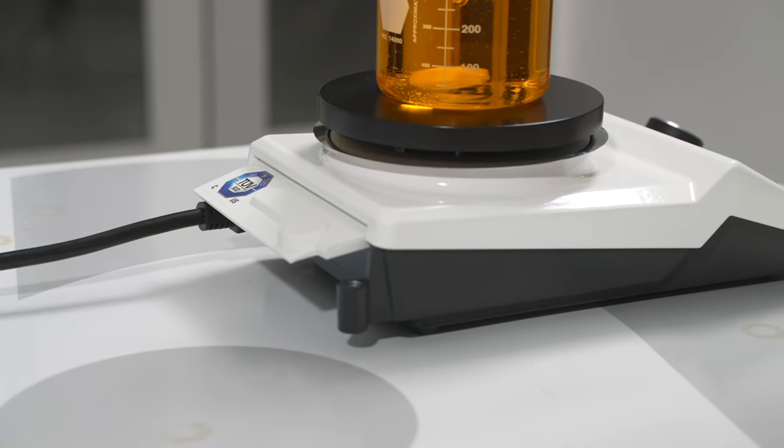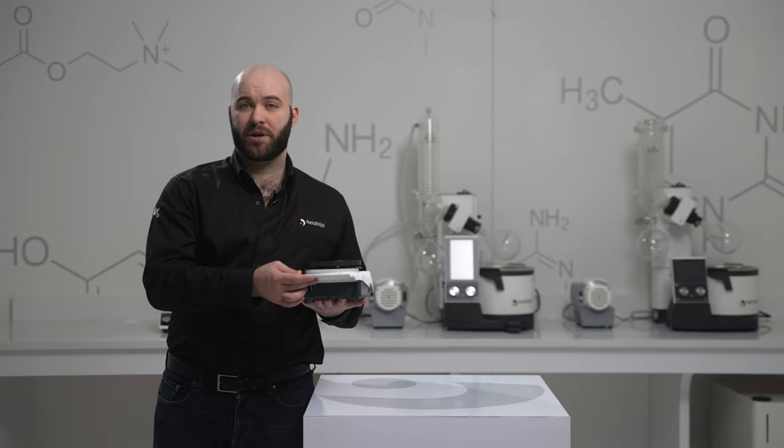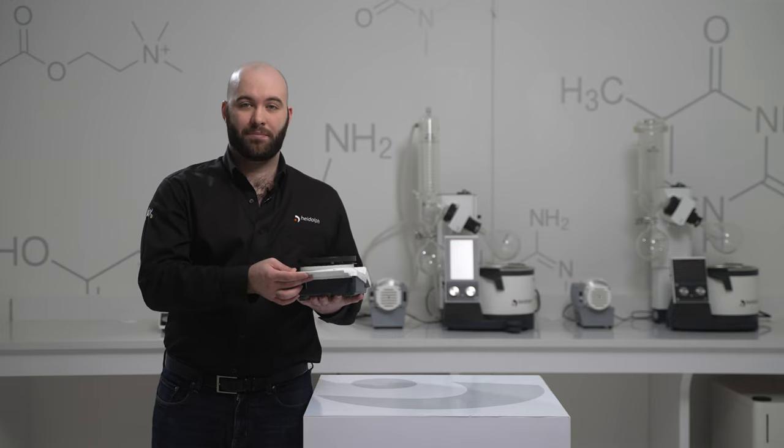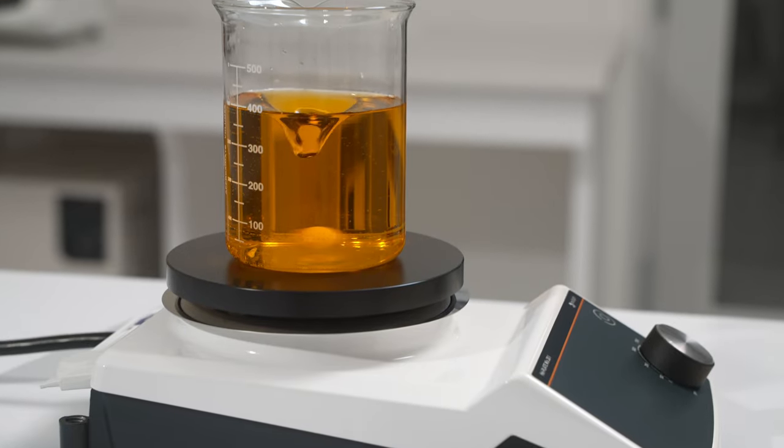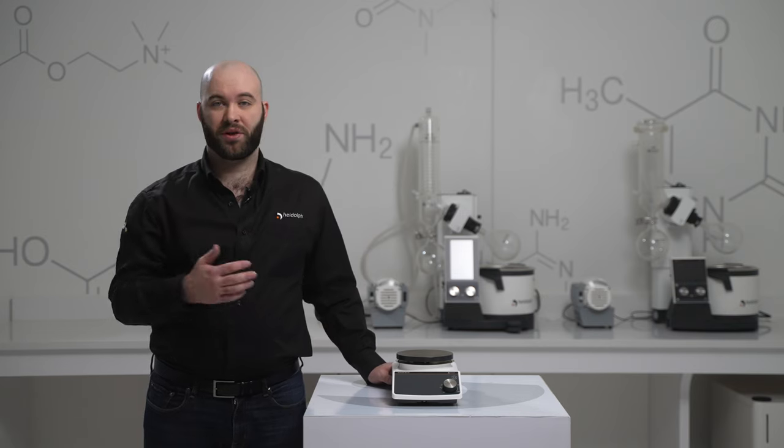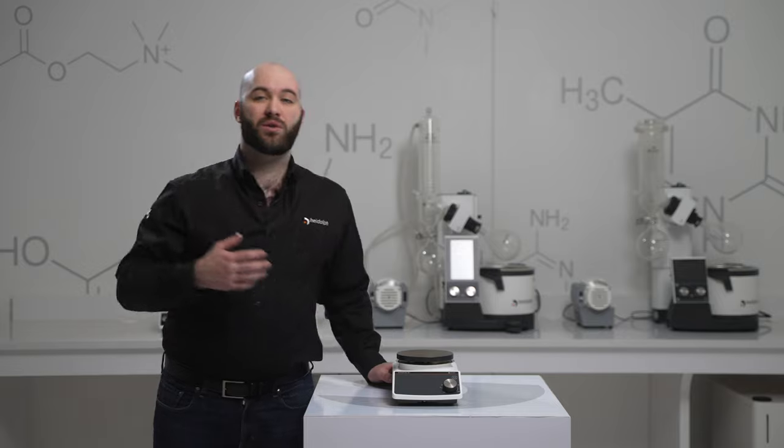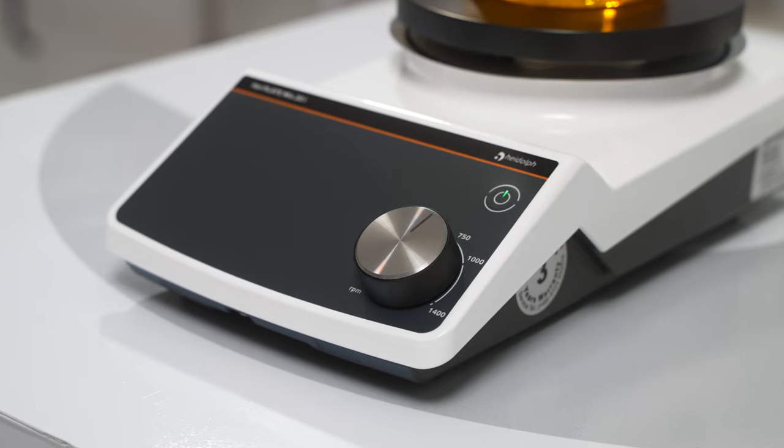Thanks to these changes, the protective rating of the hotplate has been improved from IP32 to IP42. Along with that change, the on and off switch has been replaced with an illuminated button so you can see from afar whether or not your hotplate is on.